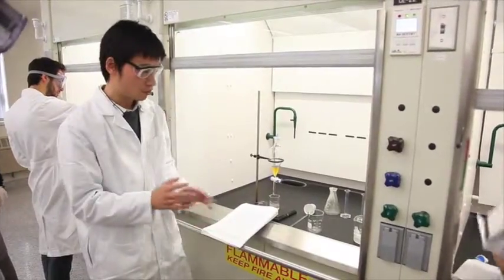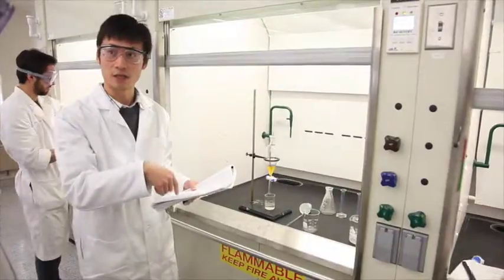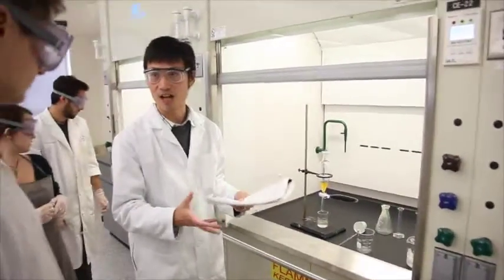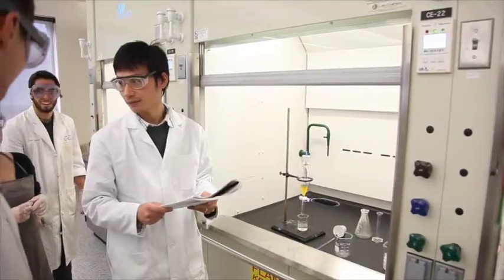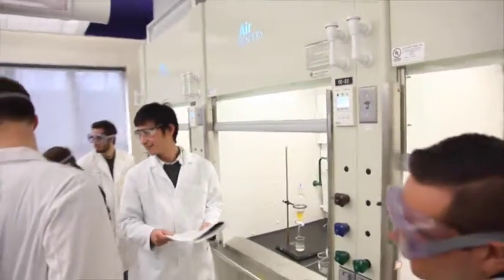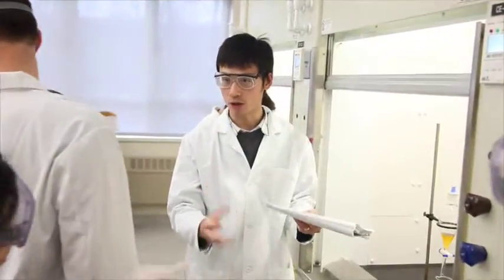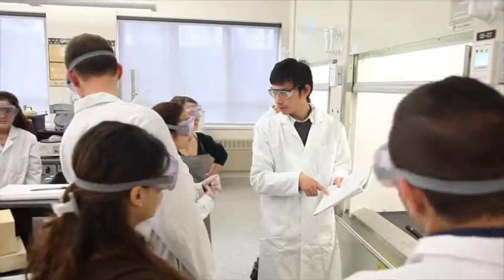After that you're going to use sodium hydroxide solution to extract the compound into the aqueous layer. So 25 ml of sodium hydroxide, 3 times, and you combine them together in the same flask. So the first step, 75 ml of water first, to wash away the acid, and then we do 3 times of sodium hydroxide.